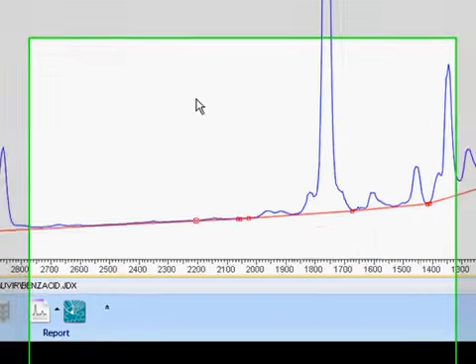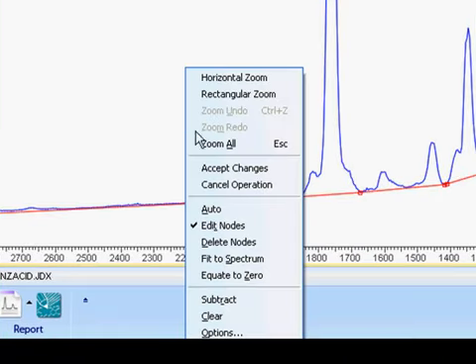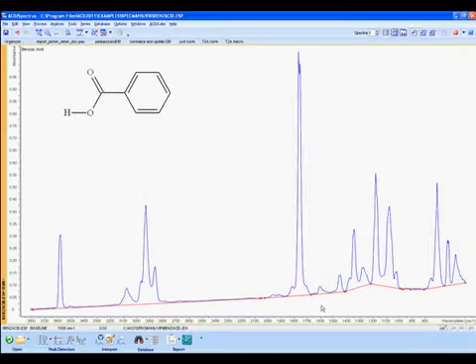We've seen how to add nodes, and we can remove them as well. Right-click and you'll see we're currently set to edit nodes. Click on Delete Nodes to enter that setting, and simply click and drag a selection box to remove all the nodes in that area.